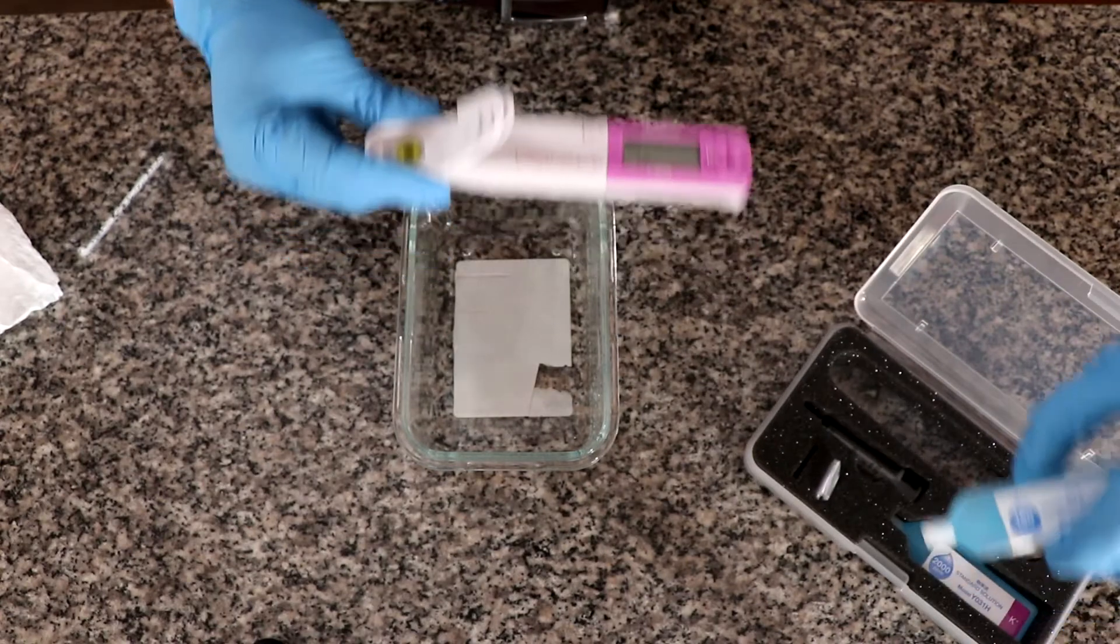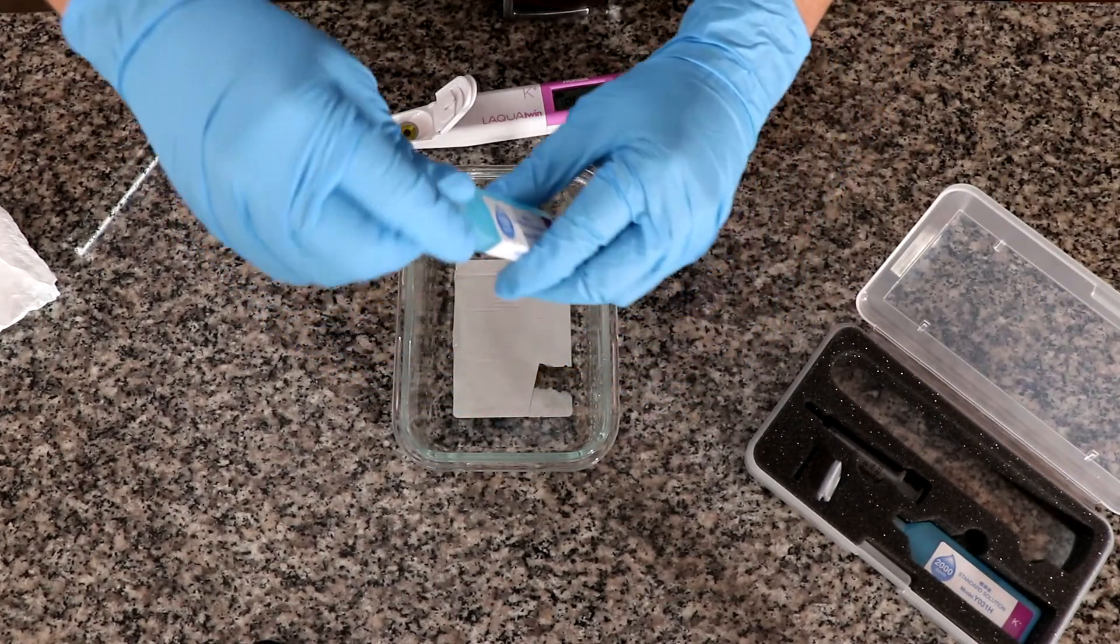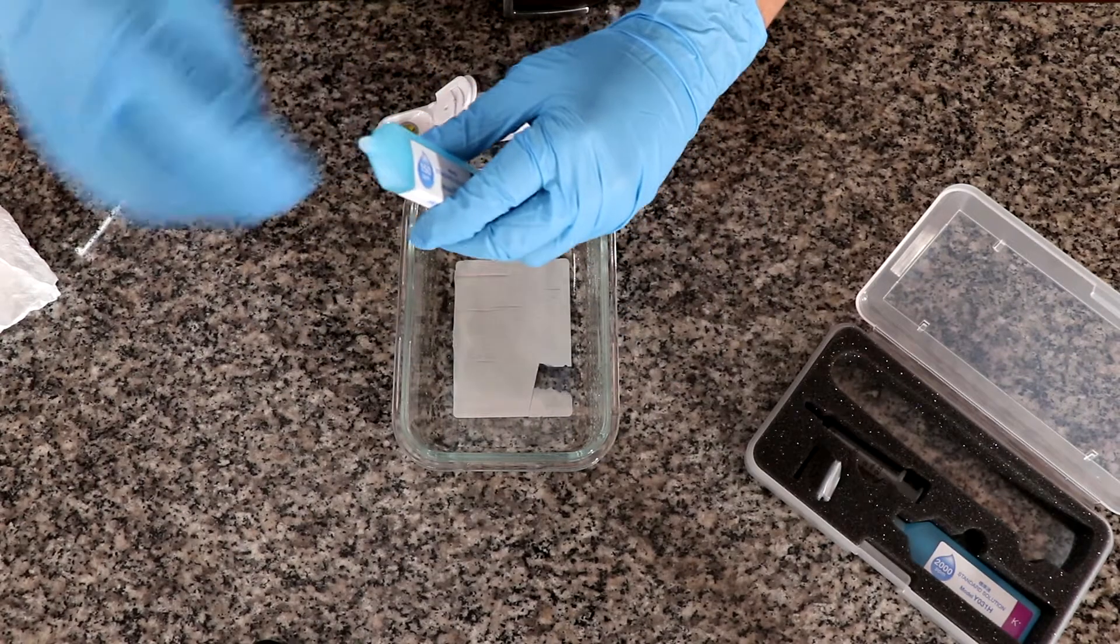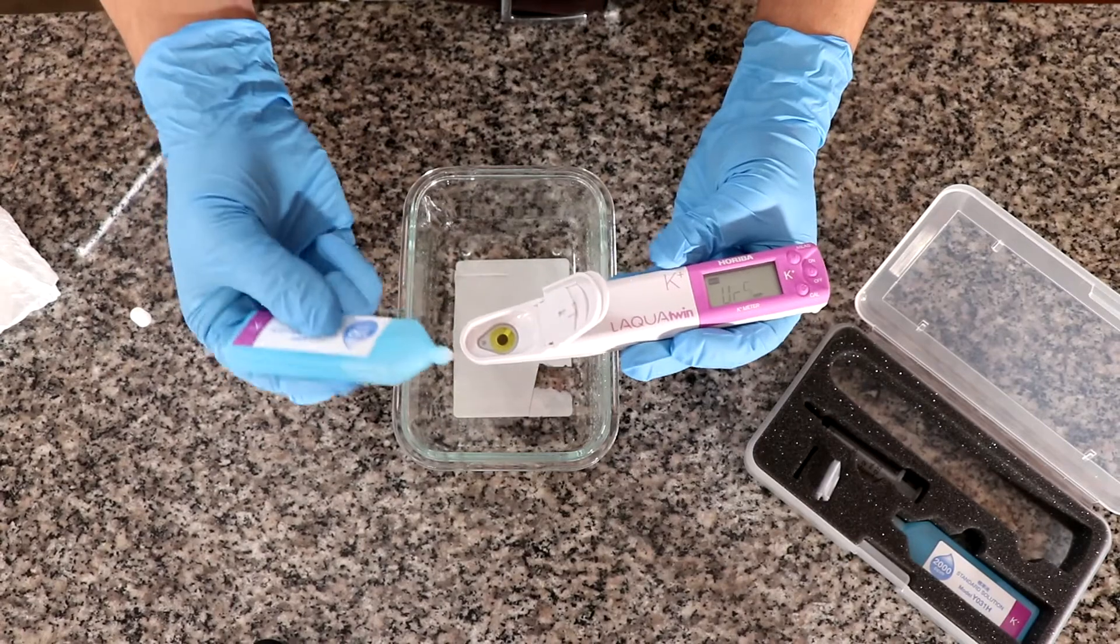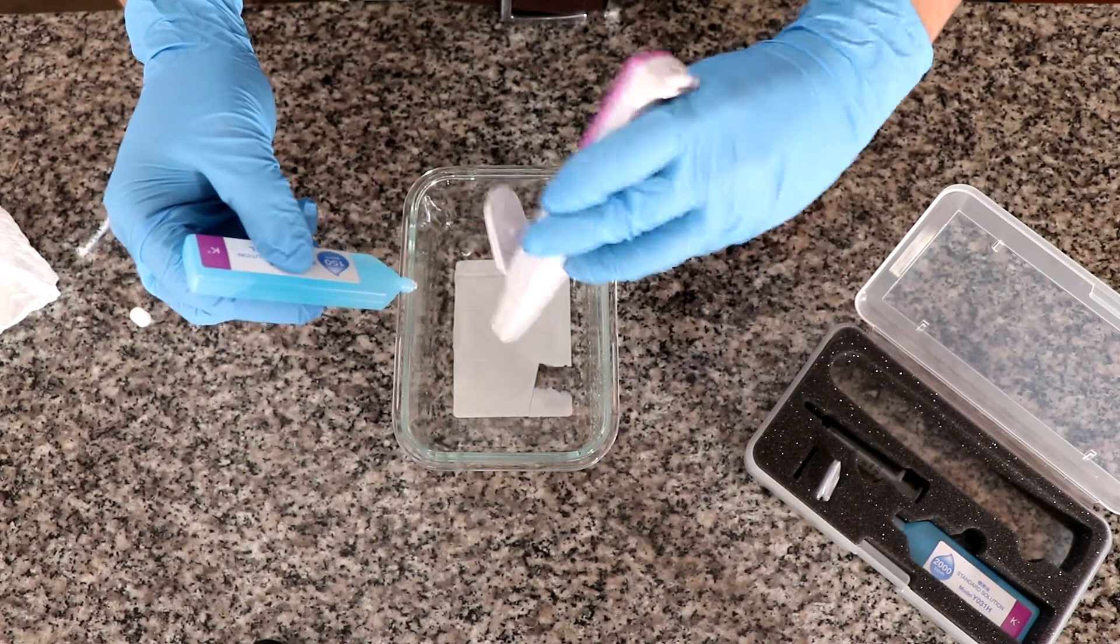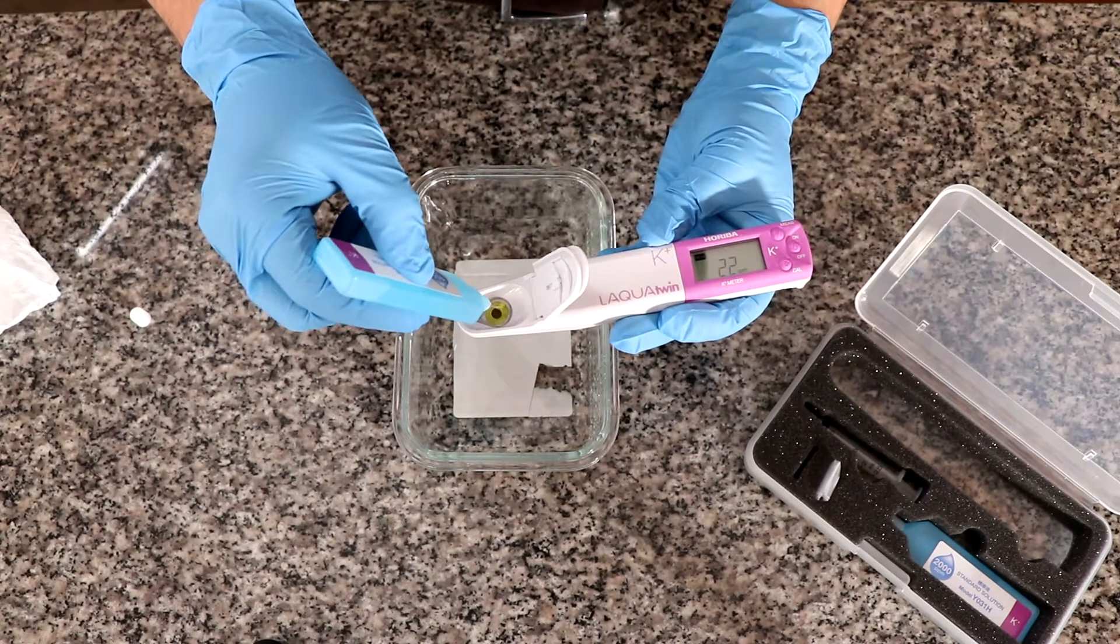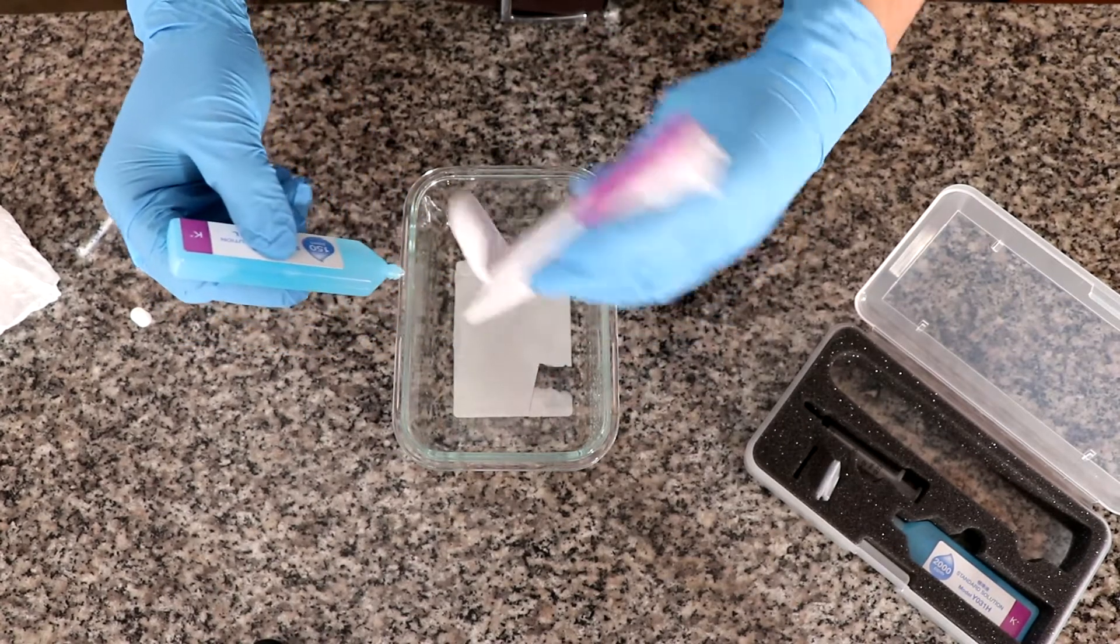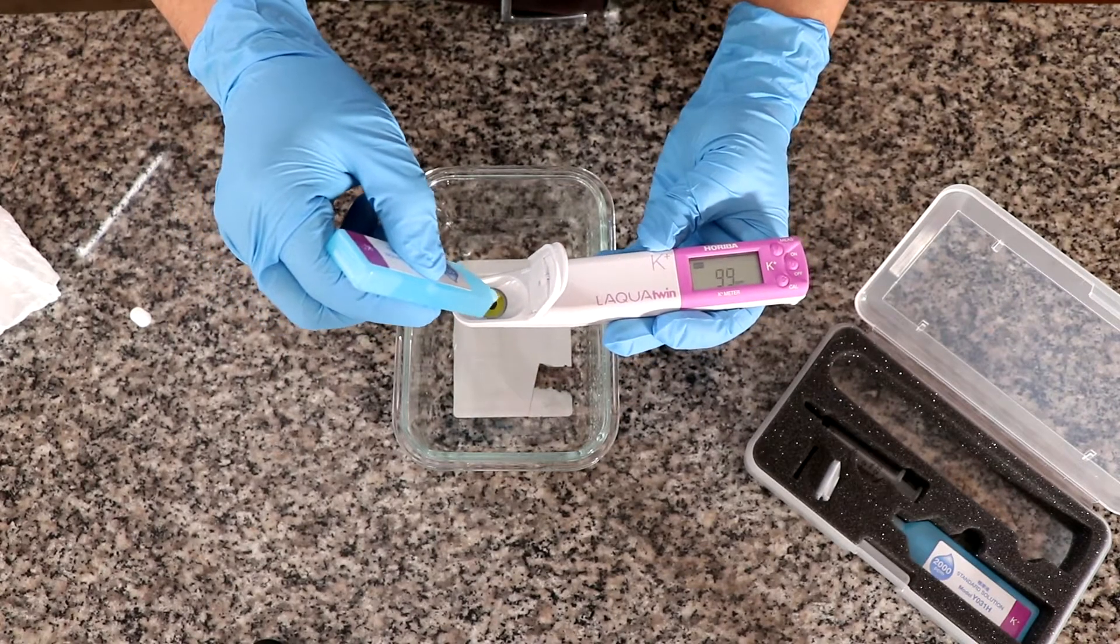Now I'm going to take the 150 ppm solution and what I'm going to do is put a little bit, dump it, a little bit, dump it, a little bit, dump it, and then finally I'm going to put enough to fully cover the sensor.